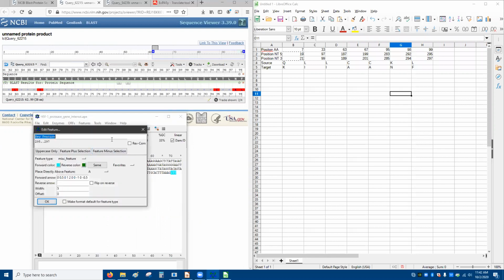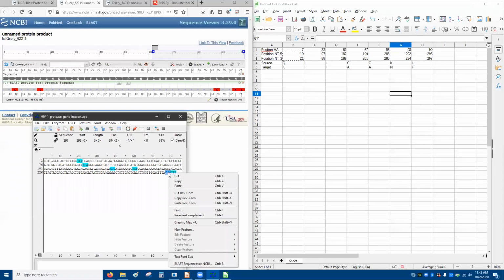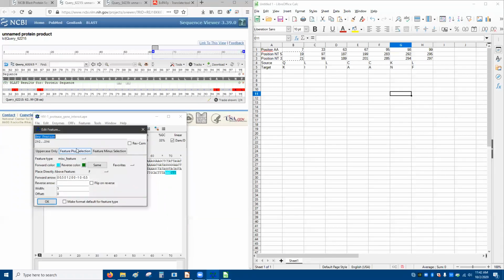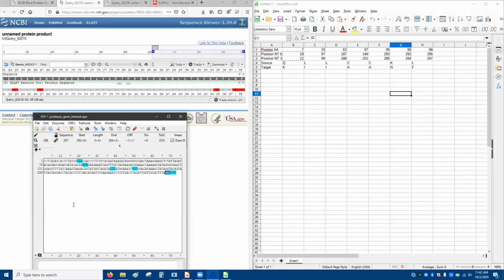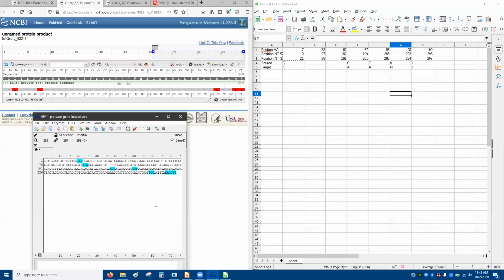Yeah. Okay. Then 1, 2, 3, 1, 2, 3, 1, 2, 3, and A. Okay, so that's all the changes we need to make to correct the sequence.